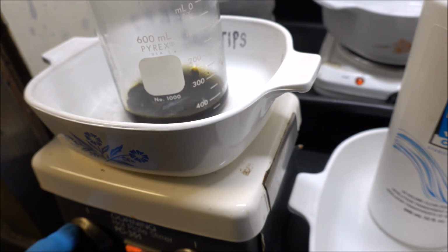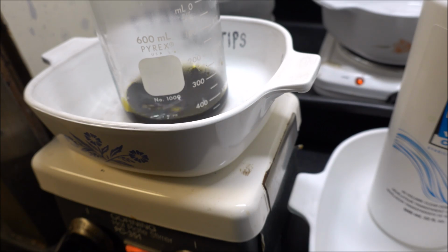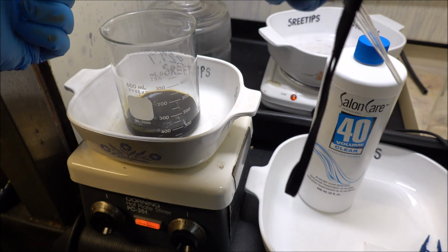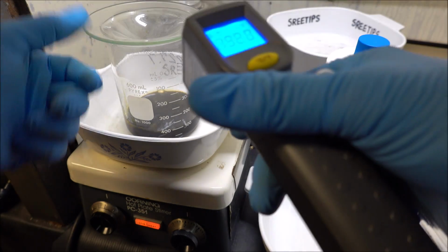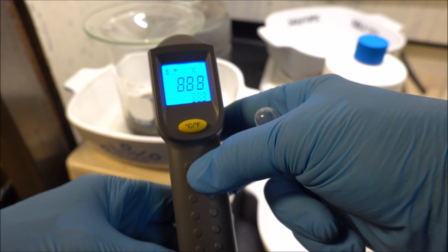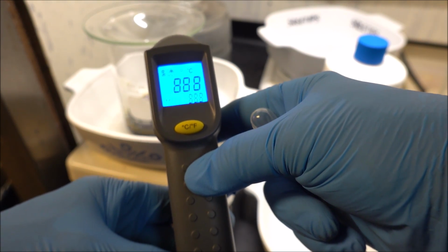Start stirring this, and I'm going to add some heat here. Start heating this up. It's been on the heat now for about 15 minutes. We've got 192 Fahrenheit, 88.8 degrees Celsius.